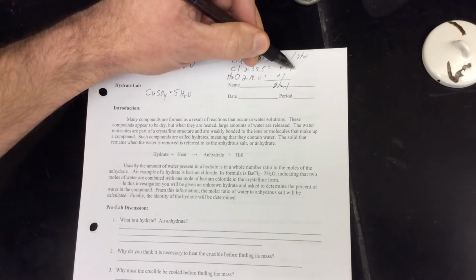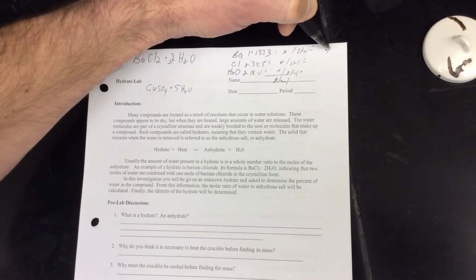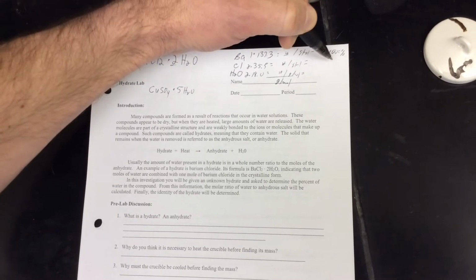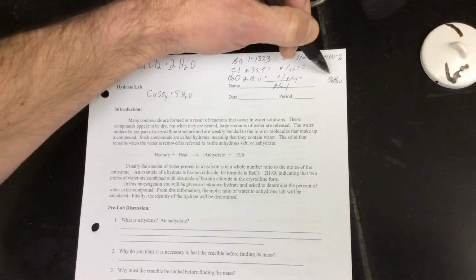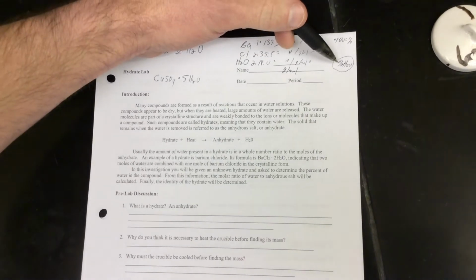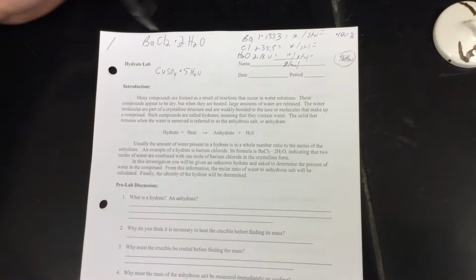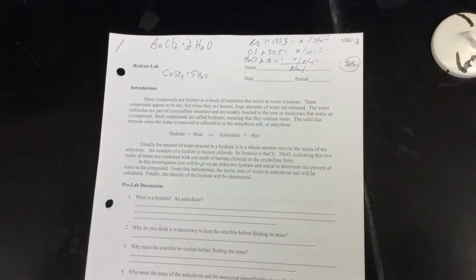You're going to get a decimal, multiply it by 100, and that will give you the percent. So this is what you're going to get as the accepted value for percent H2O. Everyone in the class should have the same accepted value because we're all starting off with BaCl2.2H2O.